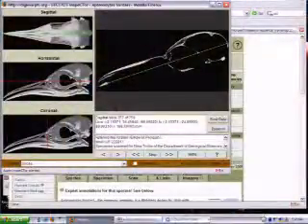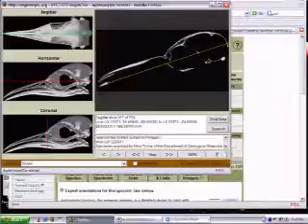We also offer the capability of looking at the raw slice data itself. This is the skull of the adult specimen of the emperor penguin. Now, one of the things that's a little hard to get your mind around with these data, that differs from what you do when you snap a picture, is that these are true, geometrically correct data.